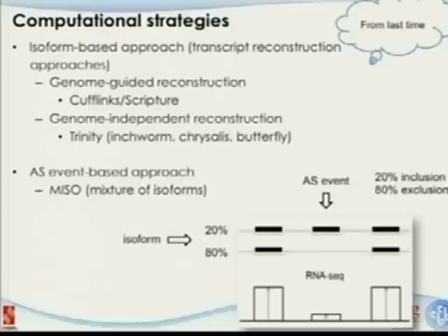For the isoform-based approach, we have the genome-guided reconstruction approach and the genome-independent reconstruction approach. Basically, the genome-guided one is alignment-based, so you first need to do the alignment, but for the independent reconstruction, you have to do the assembly first.